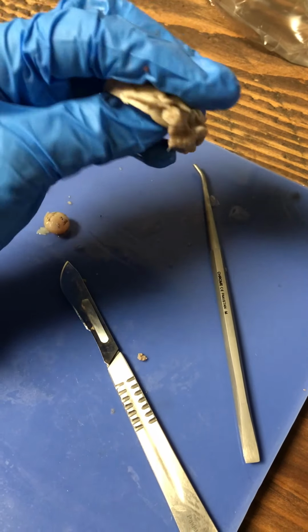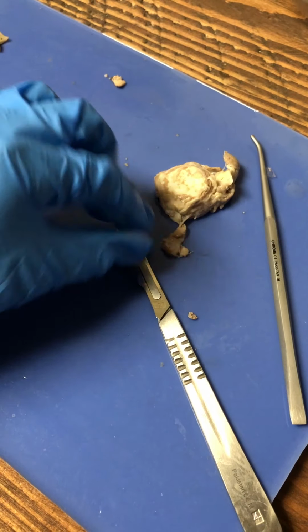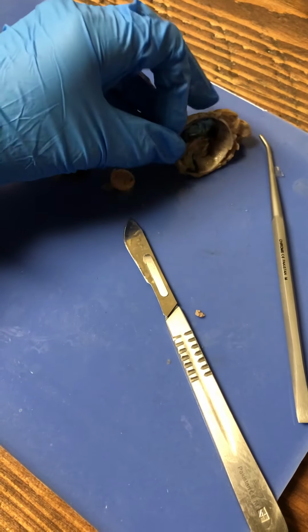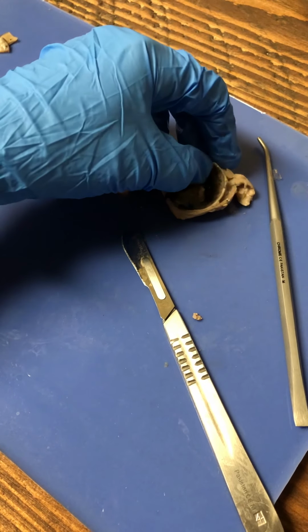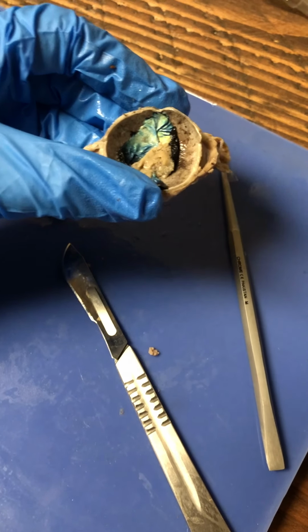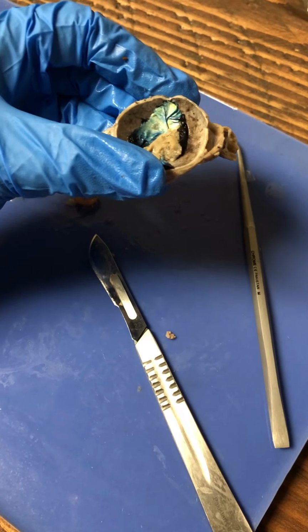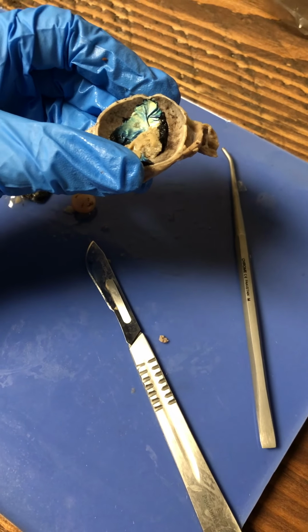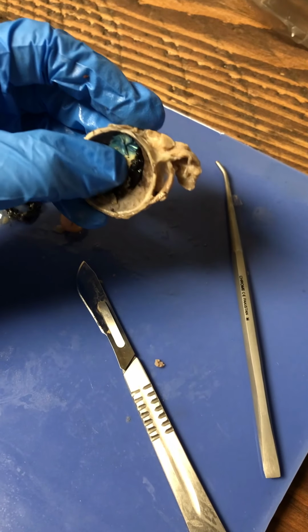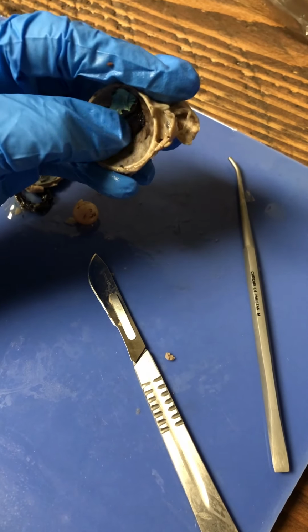And when we go back, this is the optic nerve right here. And then you can pinch it and see all the different nerves that run in it. And then also this darker blue, silver, like shiny blue, at the back part of the eyeball is the tapetum lucidum. And it just lies right between the retina and the sclera.